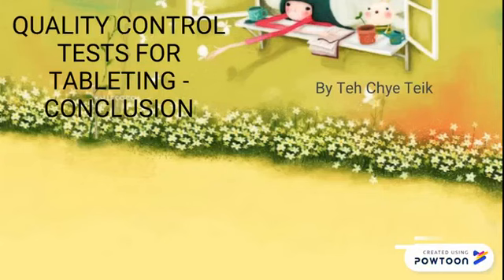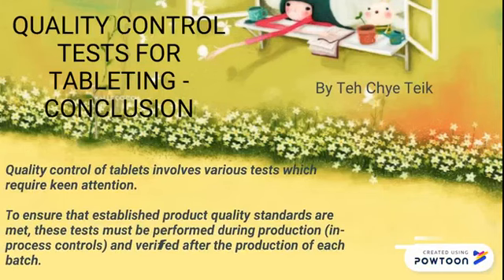In conclusion, there are many quality control tests for tableting, and these tests must be performed during production and verified after production to ensure that established product quality standards are met.